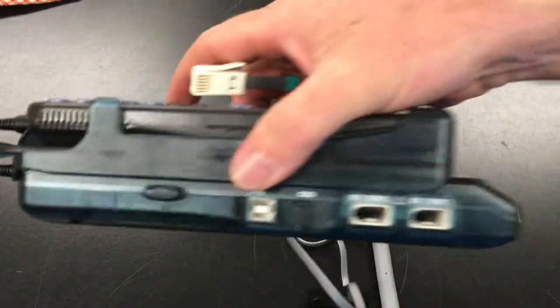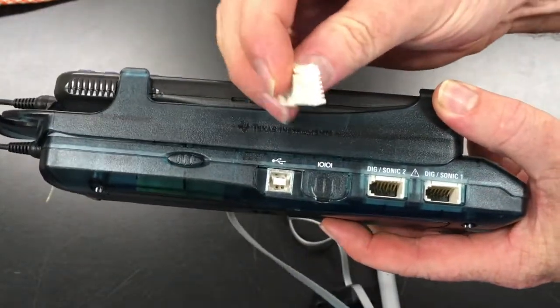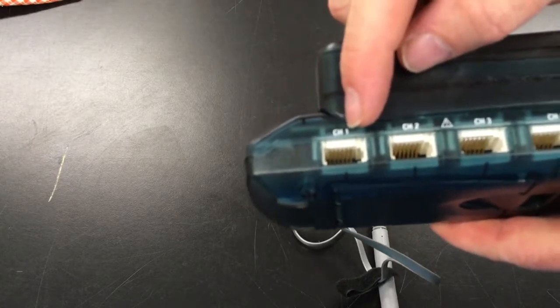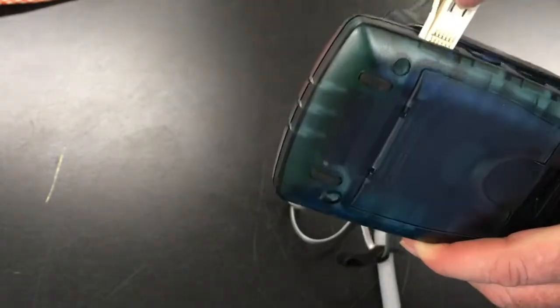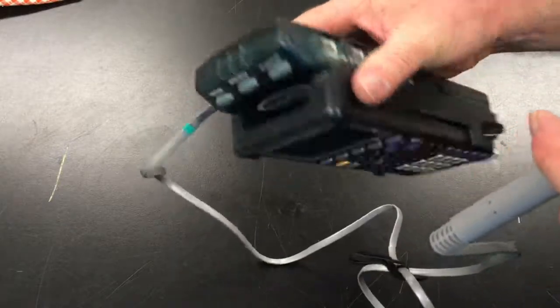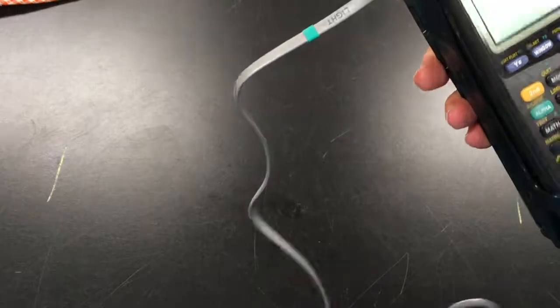And also make sure, looking at the connector here, you can see which side from that shape, it's a bit hard to see, which way it goes into these connectors. If you put it in the wrong way, you can break it. Now, ours is a light probe, so it goes in the channel 1. You can add 4 light probes or a light probe, a thermometer, etc. Okay, so that's in. Now, so we've got everything connected, our probe, our data logger, and our data logger is sending information to the computer to display on the screen for tables and values and things.